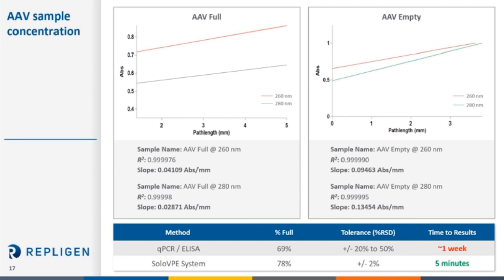Saving the best and certainly most interesting for last, AAV viral titer concentration. The 4 current methods being used, being either qPCR and ELISA, ddPCR and ELISA, AUC, and TEM, are the 4 current industry standards for this particular measurement. Most companies have their preference for which technology they believe is the gold standard. We are not trying to replace those methods.